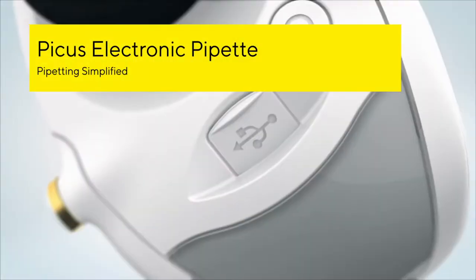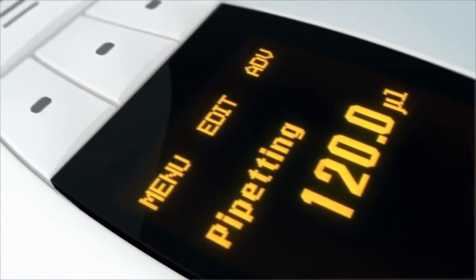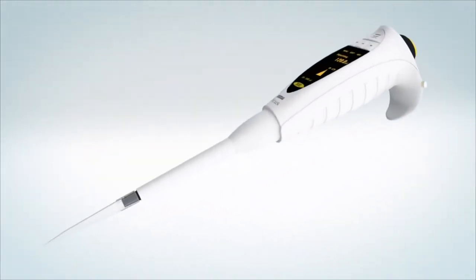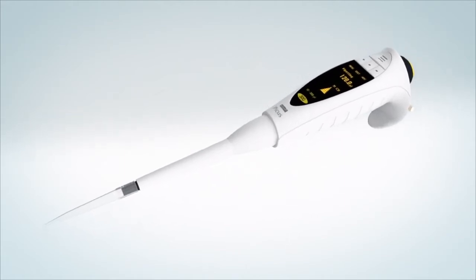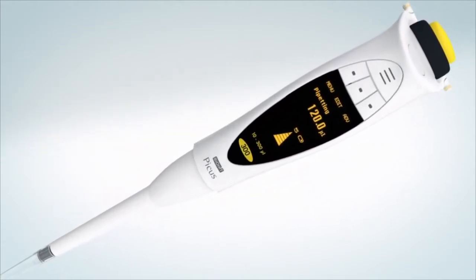The best design and the most advanced technology should not be exclusive for phones or cars only. So we created PICUS, a whole new experience for people working in the lab. PICUS is simply the lightest electronic pipette. PICUS is amazingly light for a pipette.